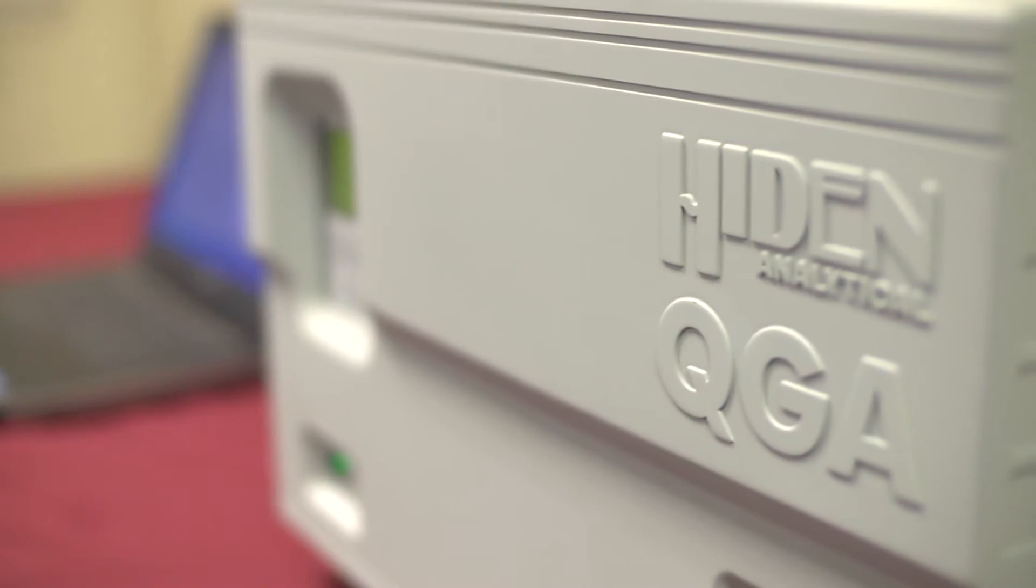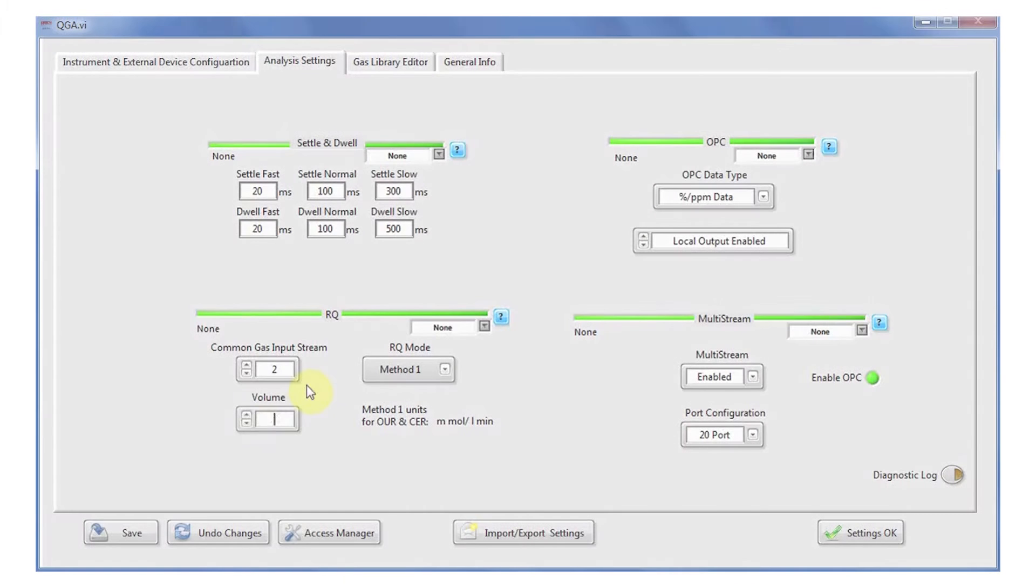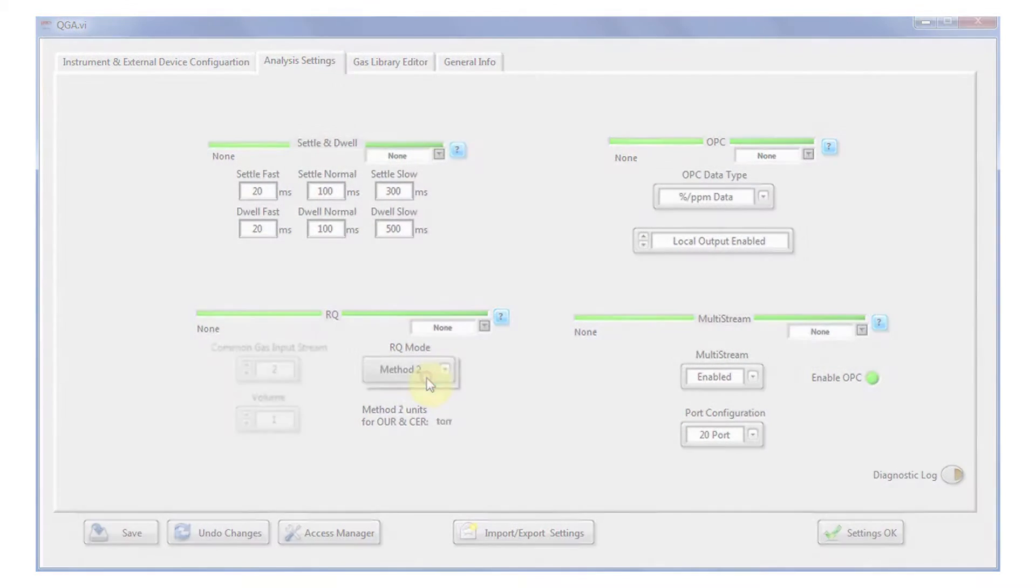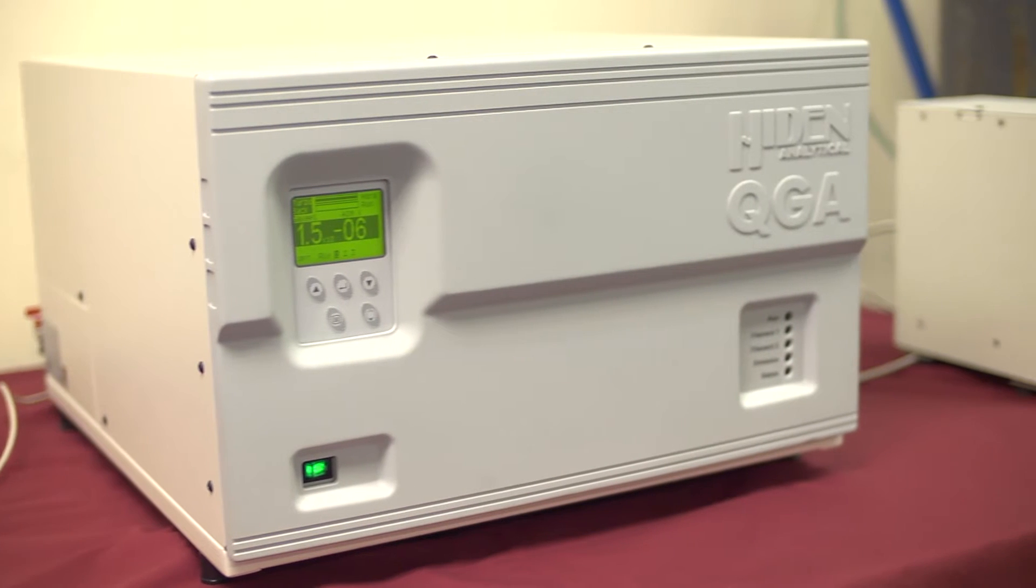The QGA system includes a whole suite of advanced features including range selection, dwell and settle time control, as well as control of the ion source for soft ionization that enables you to simplify spectra and spectral interpretation.